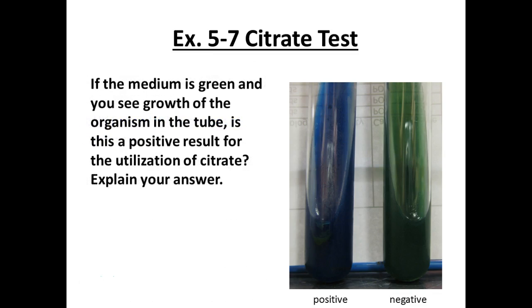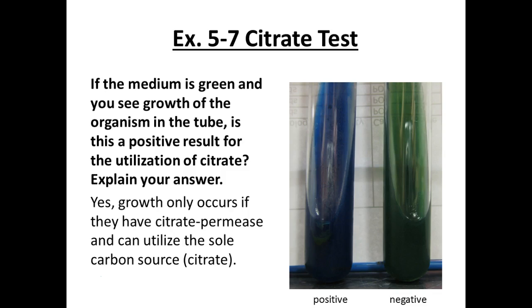If the media is green and you see growth of the organism in the tube, is this a positive result for the utilization of citrate? If it's truly growth, yes, right? But as I said, for you guys, it's not growth if you see something. It's probably an over-inoculation, which can create problems, right? False positives. Trust me, these have gone long enough. If yours is supposed to be blue, it's blue. So again, they can only truly grow if they have citrate permease.